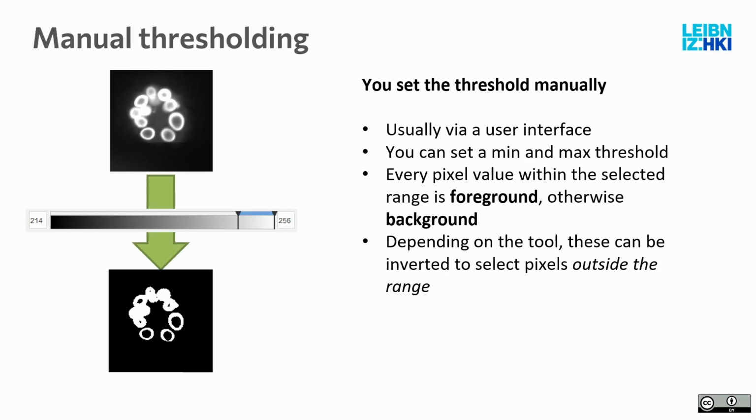So the straightforward thresholding is doing it manually. Each tool has their interfaces for that, JIPipe as well. So you go, for example, image, you go into image adjust threshold, and you can change some sliders. It will show usually what it will find. Then you tell it, okay, do it now, and then get your threshold out. This works. Is it good? This is a different question, because you will run quickly into some issues with this on manual thresholding.